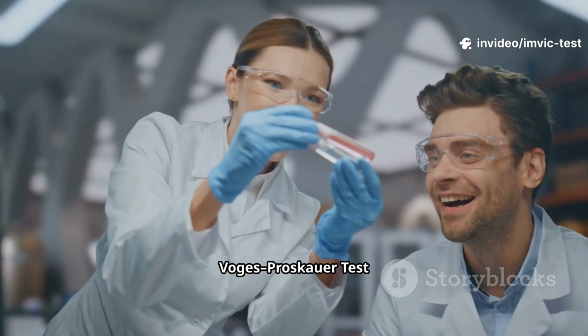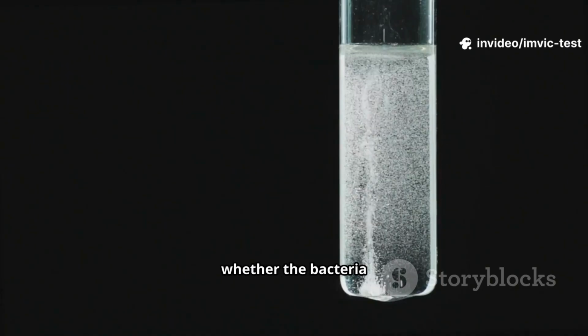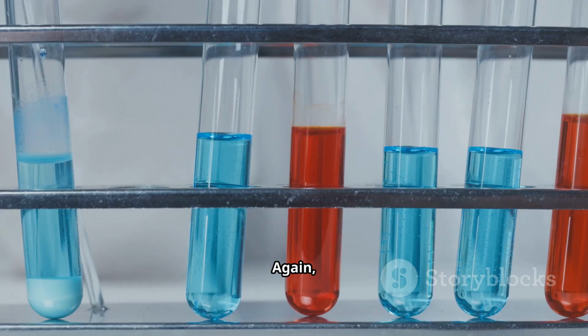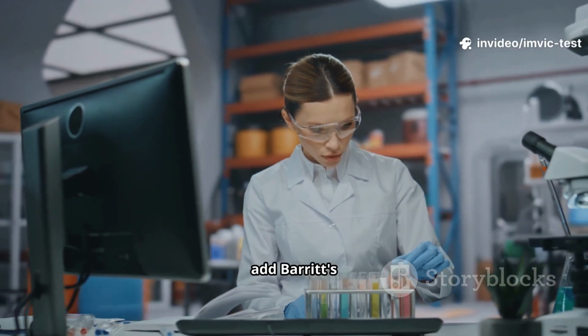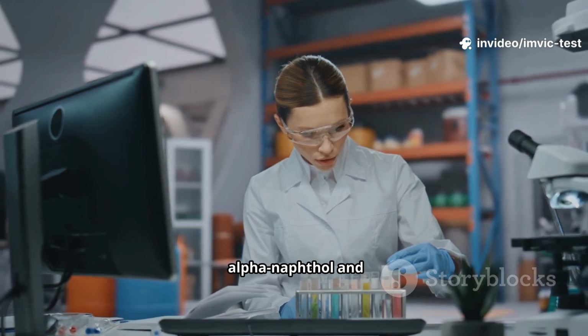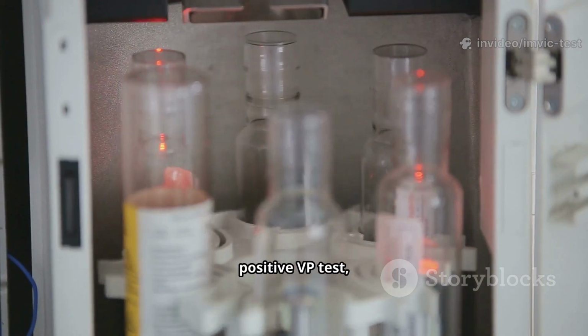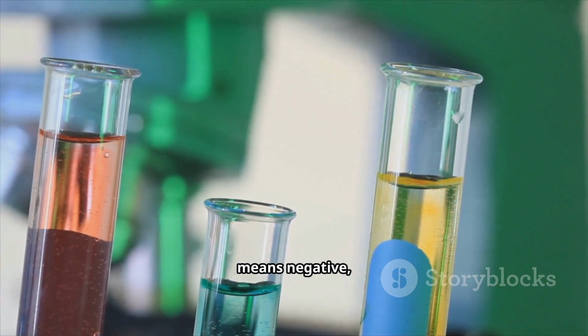The third is the Voges Proskauer test, or VP test. This detects whether the bacteria produce acetoin, a neutral end product of glucose fermentation. Again, MRVP broth is used. After incubation, add Barrett's reagents A and B, alpha-naphthol and potassium hydroxide. A red color after shaking indicates a positive VP test, seen in Enterobacter. No color change means negative, as in E. coli.